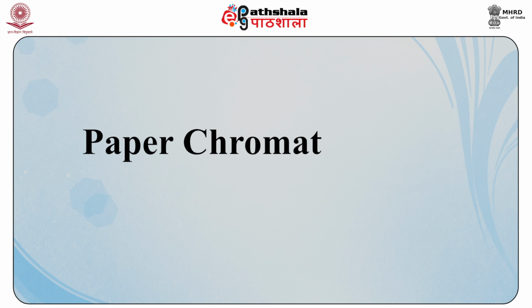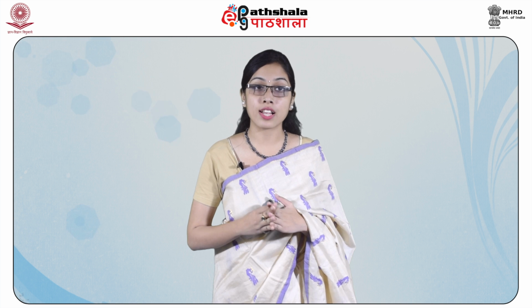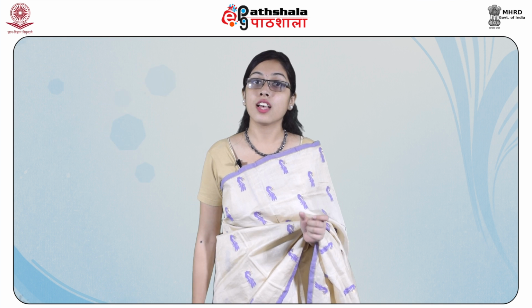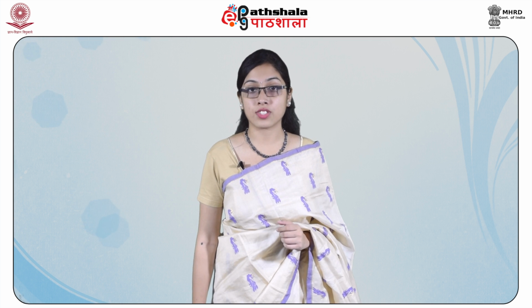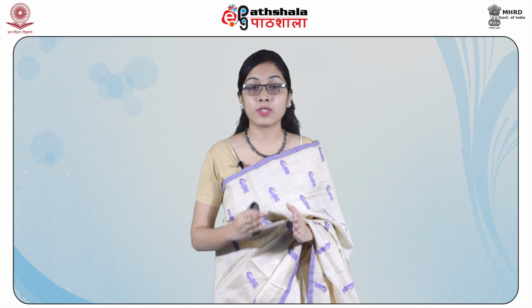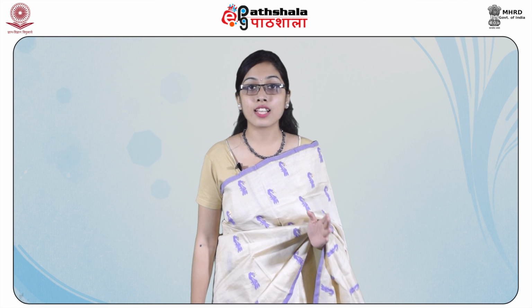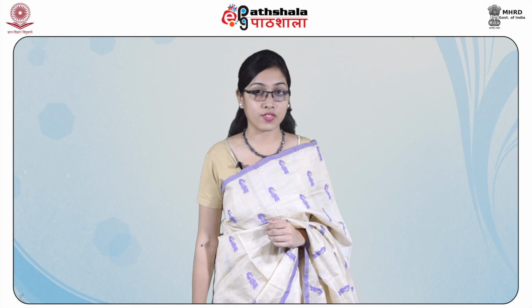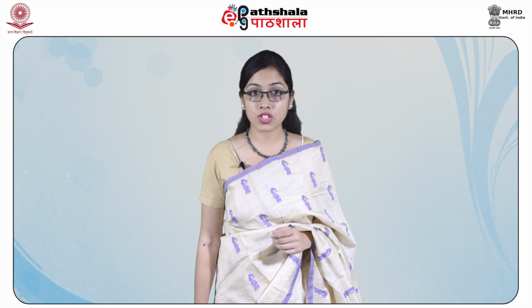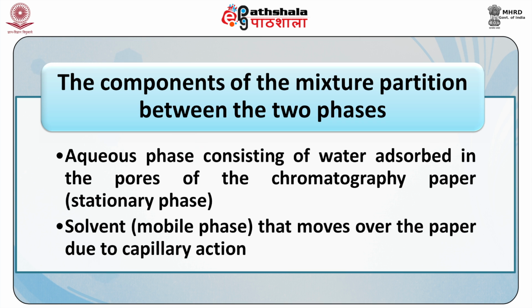Next, we will be studying about paper chromatography. In paper chromatography, substances are distributed between the paper as a stationary phase and a suitable mobile phase. The chromatography paper has highly uniform texture and thickness. It is made from cotton cellulose and has low content of additives. For the separation of the mixture, a discrete spot is applied on the paper. The components of the mixture partition between two phases.